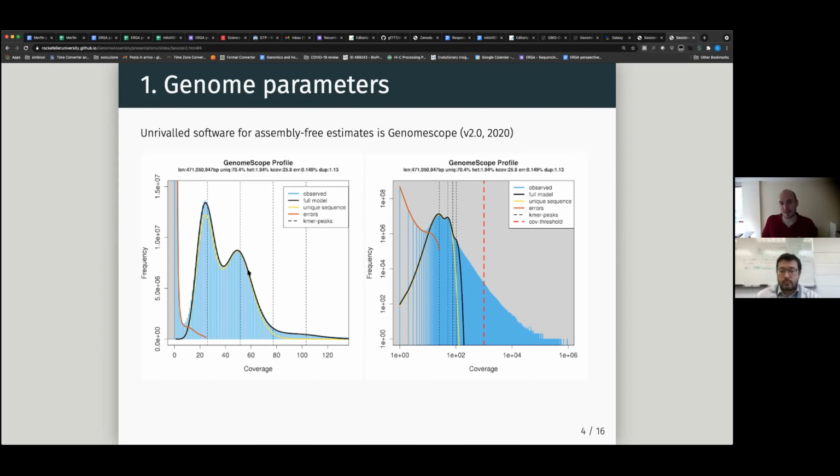And this is what happens here, and of course, it's error prone as anything in bioinformatics, but it's actually very, very accurate at this point. So we're getting very, very accurate information. The first thing we can see here is that there are 2 main peaks, and then there is this big peak that is peaking somewhere we don't see in the plot.